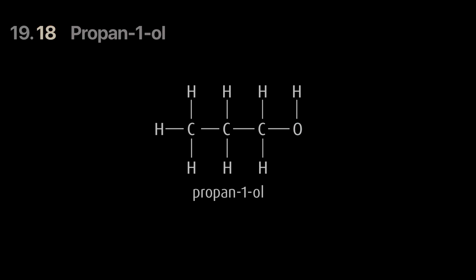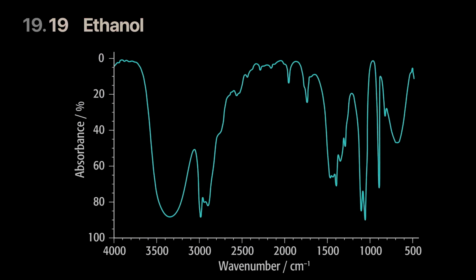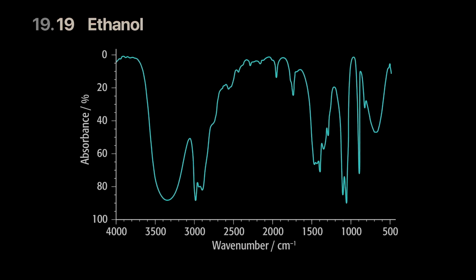Now, ethanol will have something very similar, because if this is propanol, ethanol has the same number of bonds. So what you start realizing is that, hey, this is near 3500. Remember, 3500 is basically your OH. So I am going to mark this fellow. I'm going to scroll up a bit. And so this band is because of the OH. This band is because of, and I've been doing this so I know that, the highest value is always for the OH. And these are 2 different bands. It's not one peak, these are 2 different peaks.